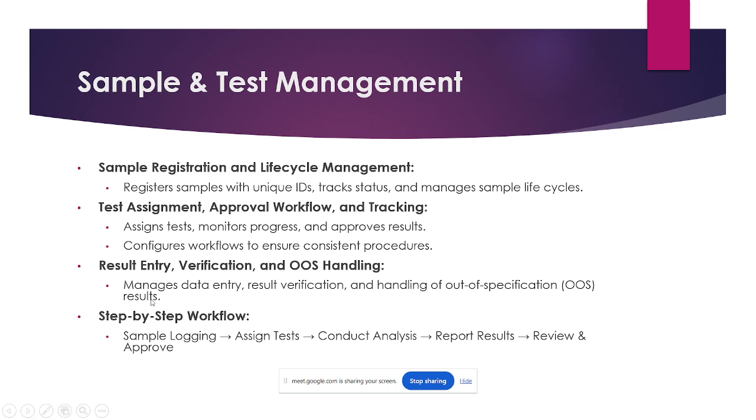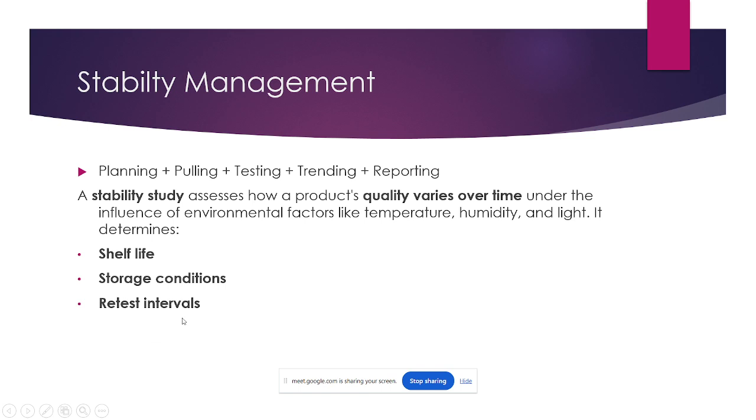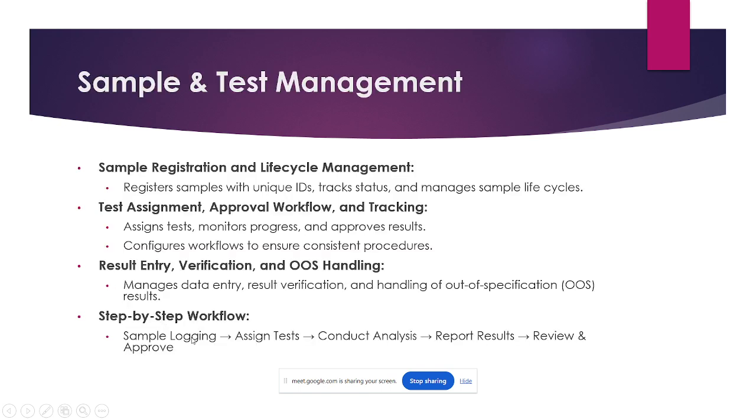Okay, and coming to the step by step flow for the sample life cycle. Initially we need to log the sample. After logging the sample, we need to assign the test to the specific sample. After that we need to conduct the analysis, whatever the test we are using. After conducting the analysis, we need to report the results. After that, review and approve. This is the simple sample life cycle. Okay, if you are asked about the sample life cycle, this is the sample life cycle.